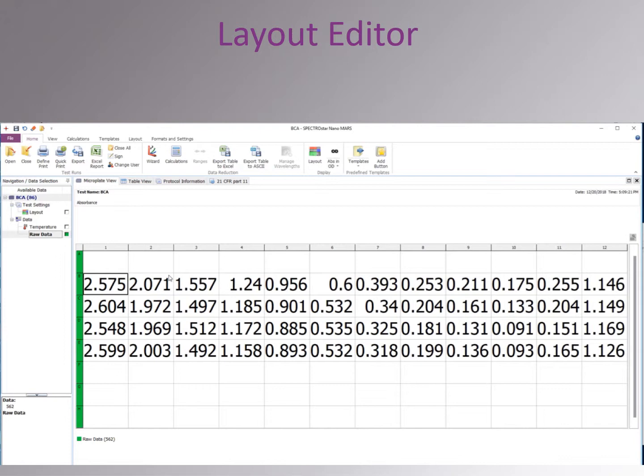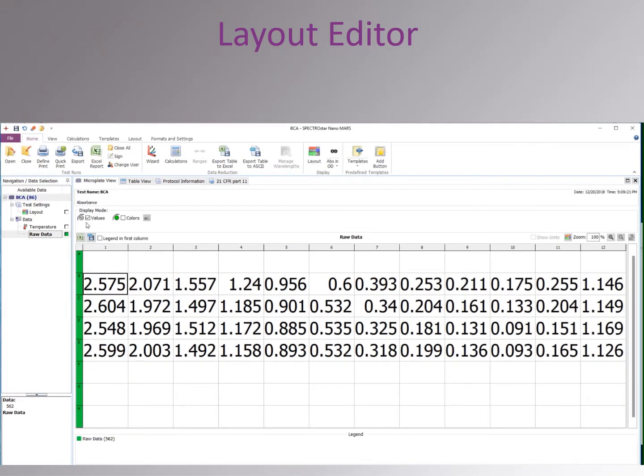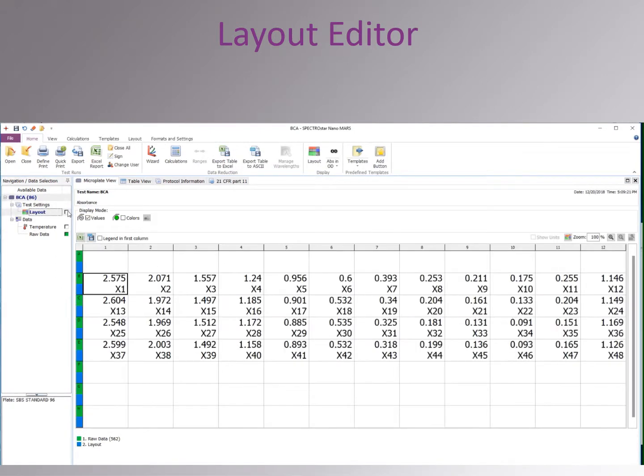The OD value for a group of protein samples is shown here. The data is the OD at 562, which is relevant for the wavelength of the BCA assay. You can add information to the current view in this microplate representation.